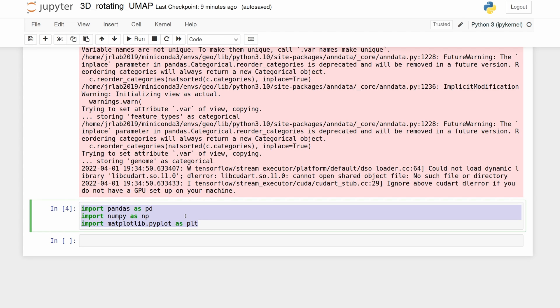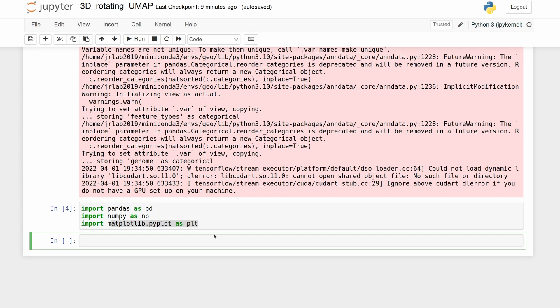These are the modules we're going to be using: pandas, numpy, and matplotlib. Let's go ahead and just plot the 2D UMAP.